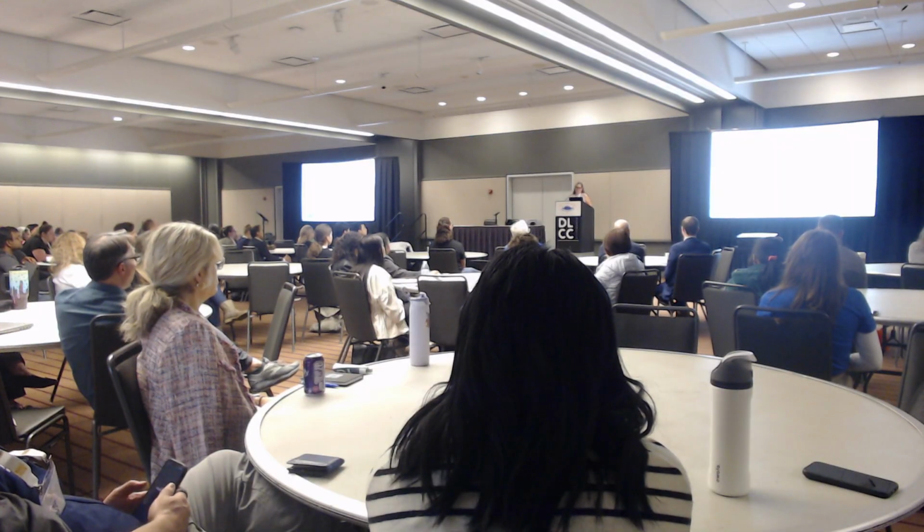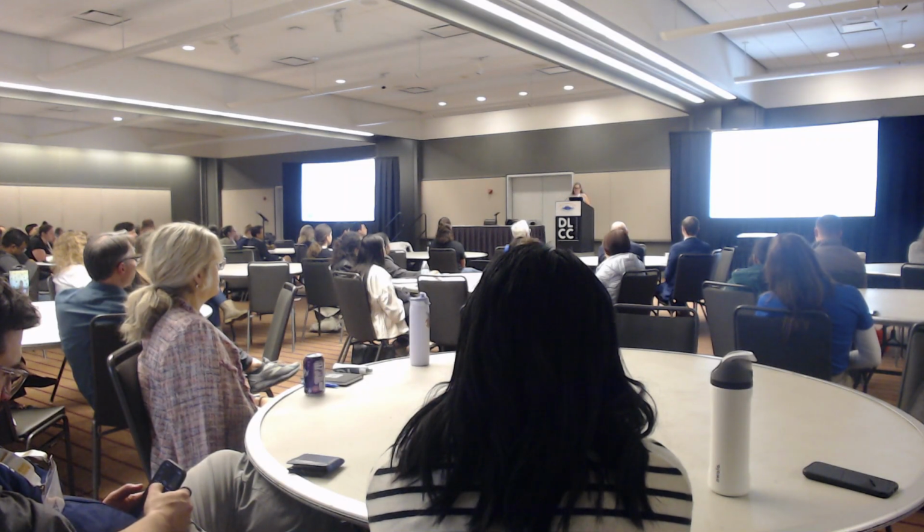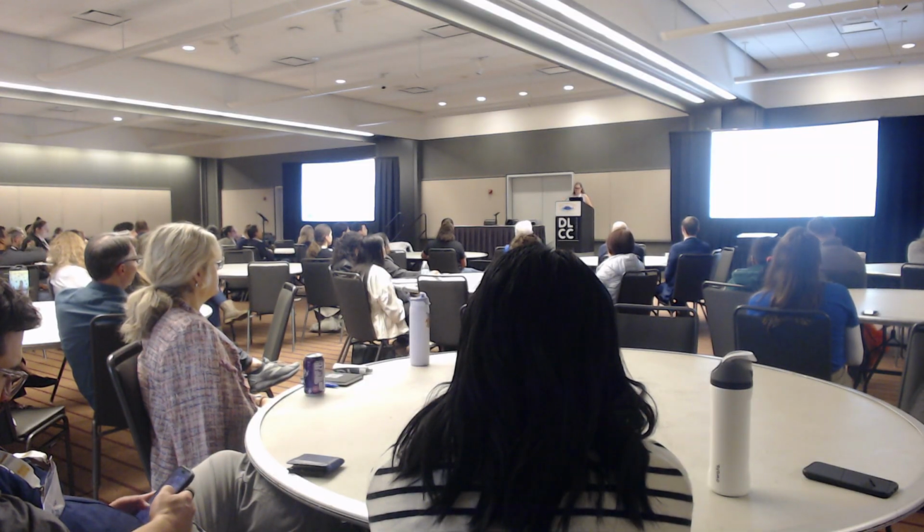Now, when we go to a proactive approach, there's a bit of higher uncertainty. It can be filling a gap or it can be something novel that you think is going to be of interest to certain groups. That being said, it's more uncertain because, if you've got a couple of people interested, it's great, but you want to have something as a service that's sustainable. So you have to be a bit more strategic. And that's where I'm using the Biomodal evoC testing that I did in the core as a model for how I went about this.